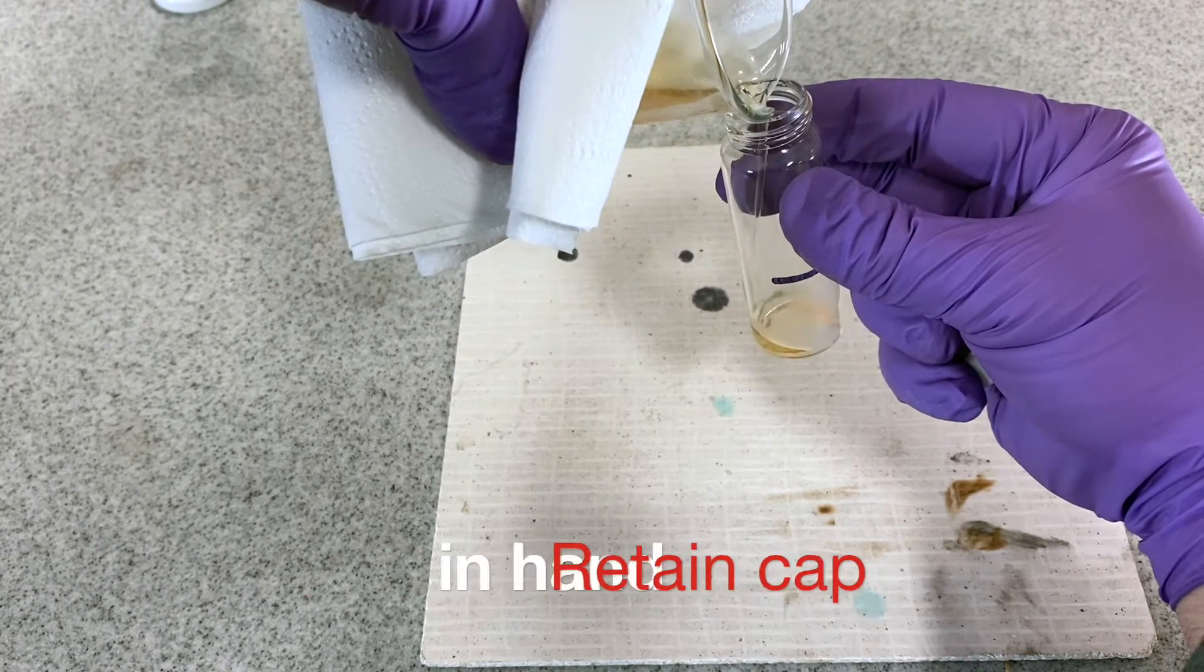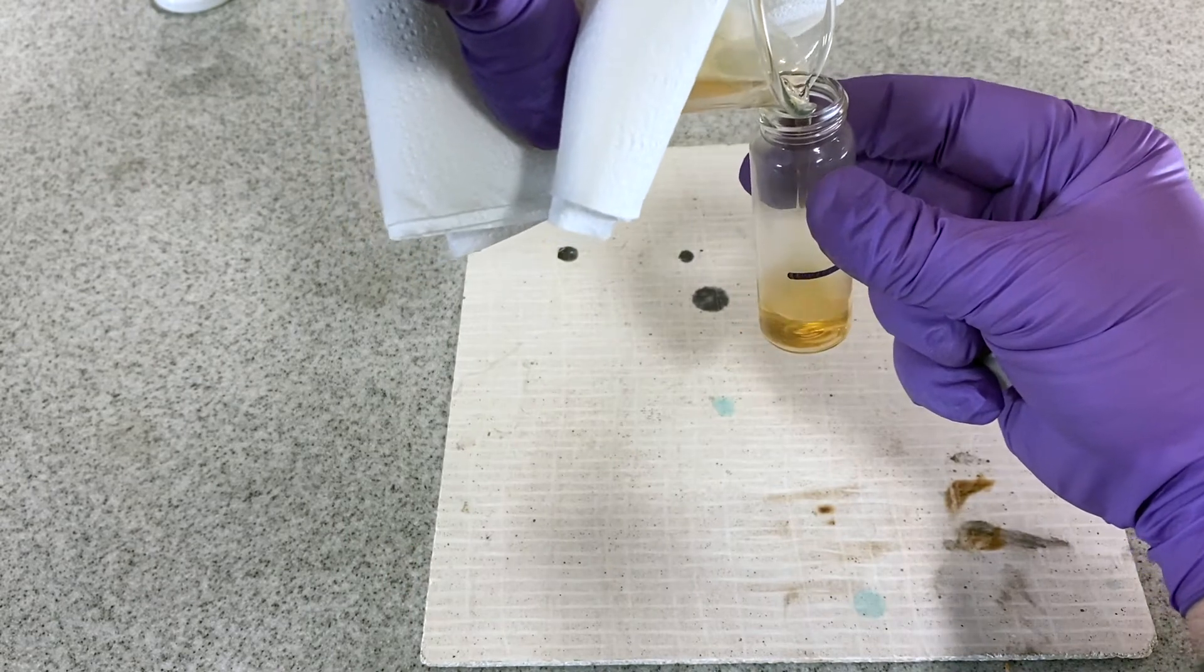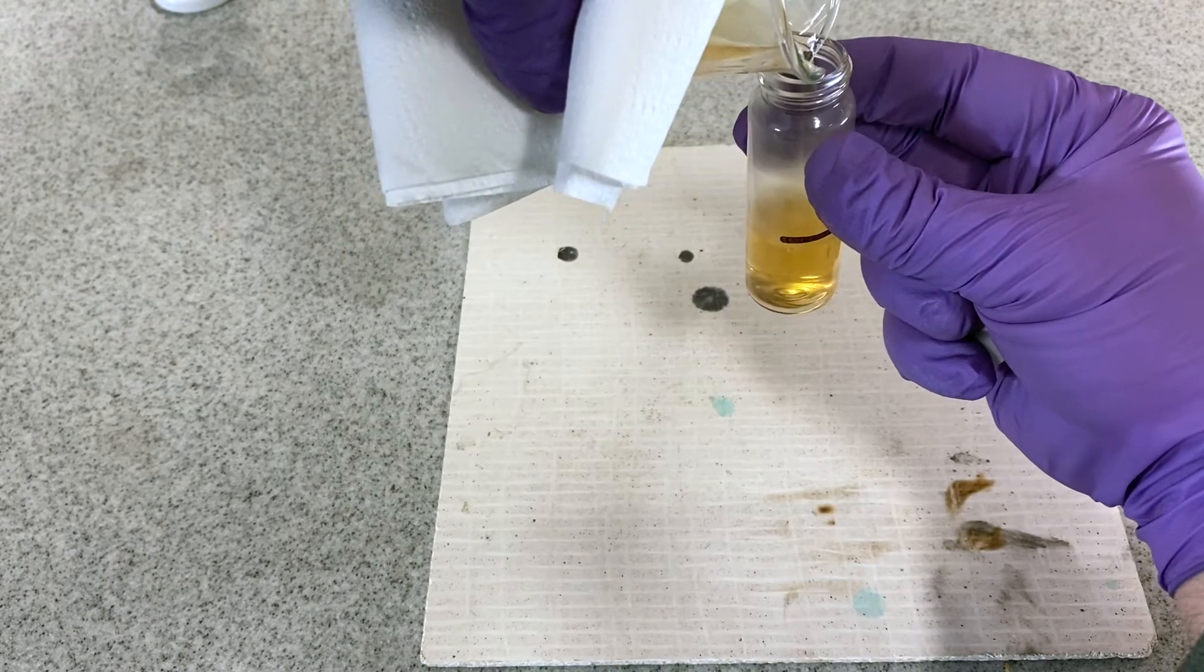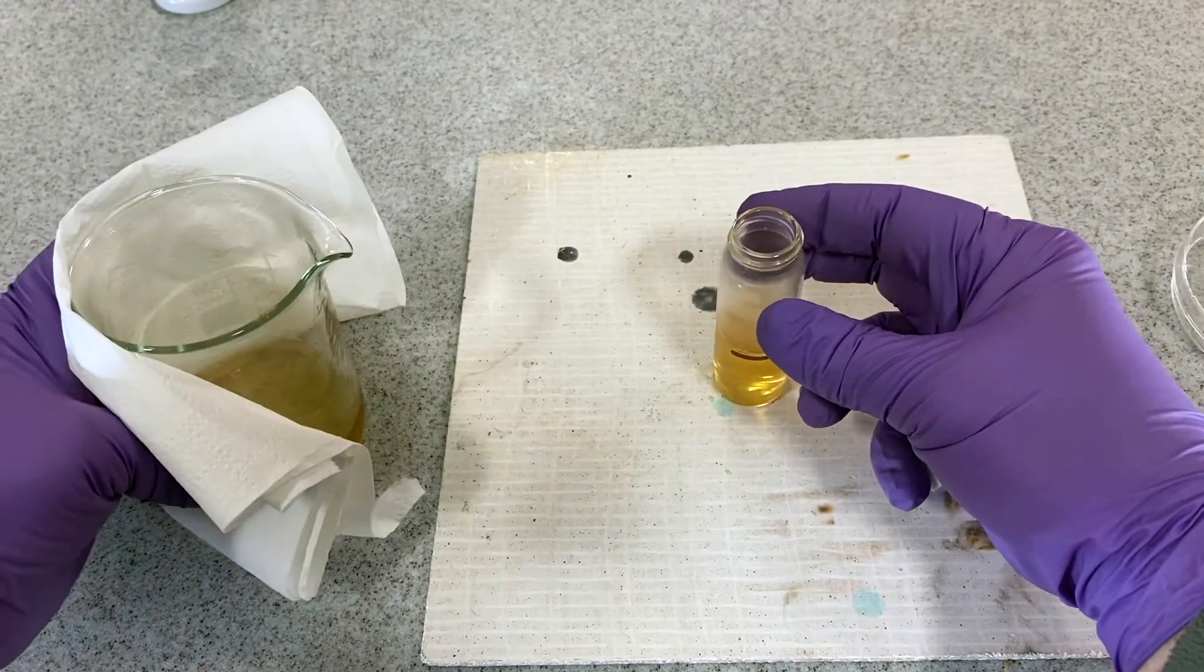Some of the agar medium can be poured into the sample bottle up to the measured fill line. This can be done directly from the beaker.